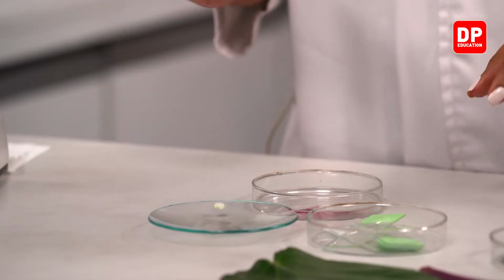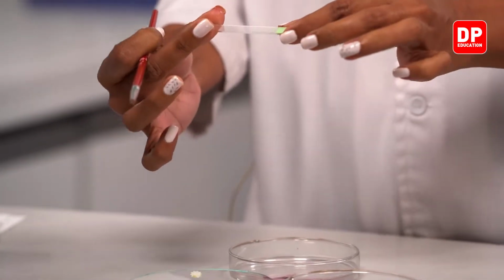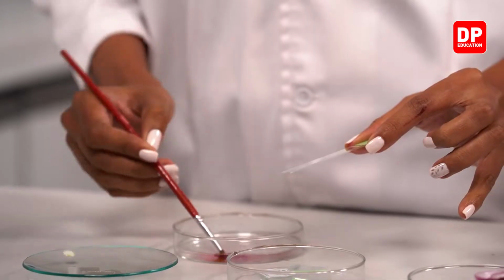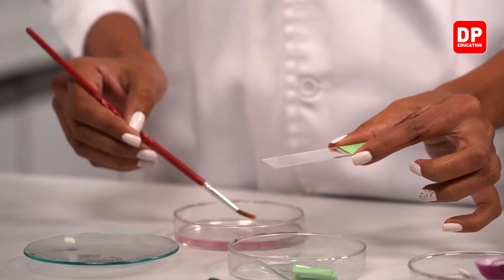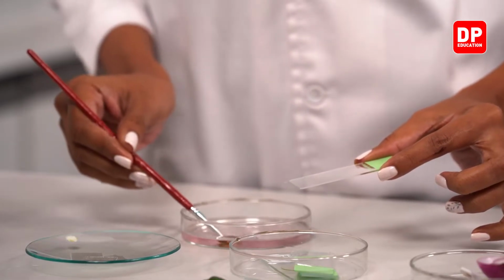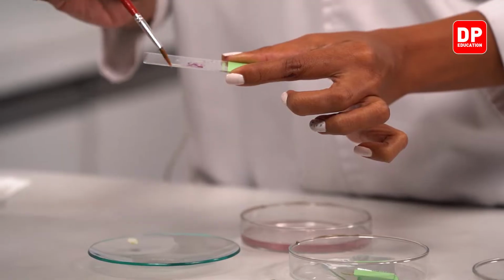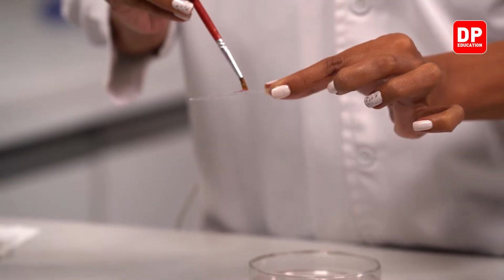Now here I have a paintbrush, and I'm going to take a slide. This is a glass slide. Now you all know that glass slides and cover slips that we are going to use should be very clean, right? I'm going to take this onion peel to the petri dish now. And you have to spread it like this until there are no wrinkles. And then you need to cover this with a cover slip.